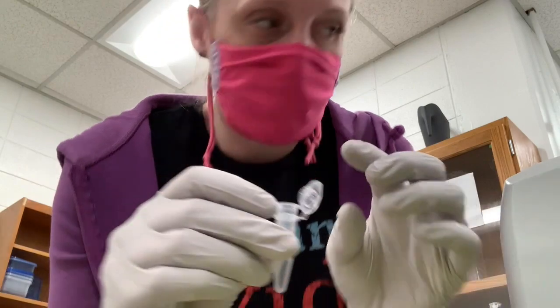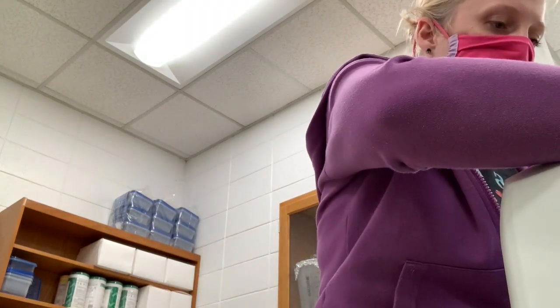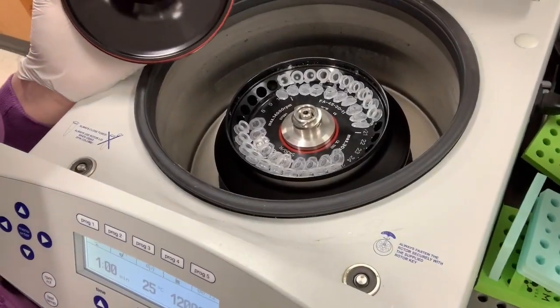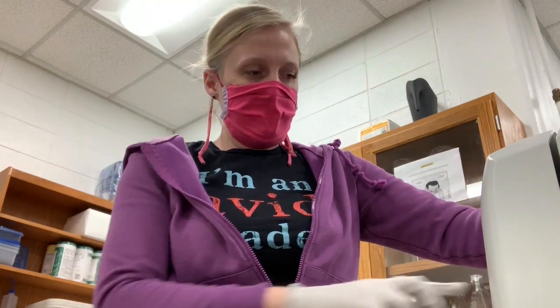Okay, I'm over at the centrifuge. I'm going to put my samples in the centrifuge to elute the DNA that I have been working to purify. The only thing that's a little bit different in this step is that your tubes will have the microcentrifuge tube lid kind of hanging out, and I'll show you how I handle that in the centrifuge. The centrifuge is so powerful that these lids can break off, and it can also be kind of difficult to fit everything in there. And so what I do is put all of the lids inward facing, and that helps. If you have a lid break off a tube, that happens occasionally, and that's okay. You can just flip it back on. Usually you'll hear a big pop during centrifugation if that happens.